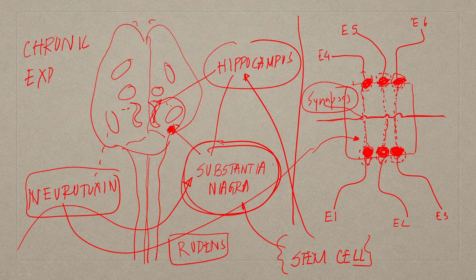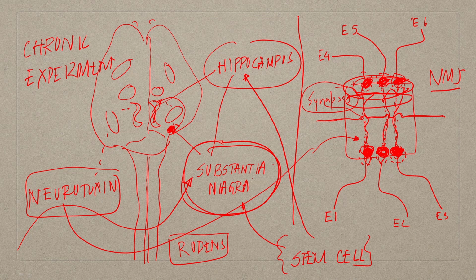Similarly, you can use this model for another very interesting thing. Say, for example, instead of different parts of the brain, you want to understand how a neuromuscular junction works. You can grow the muscles on this side and the neurons on this side. They will travel and form connectivity, and you can study neuromuscular junction toxins. You can put the toxin on the synaptic or neuromuscular junction side, or on the neuronal side. Similarly, in the case of the substantia nigra and hippocampus two-chambered model, you can put the toxin on this side too and see if it influences substantia nigra, and vice versa.